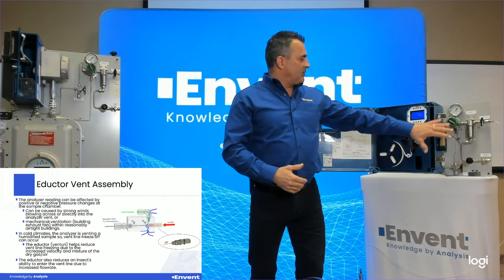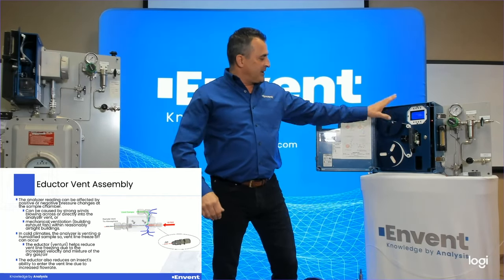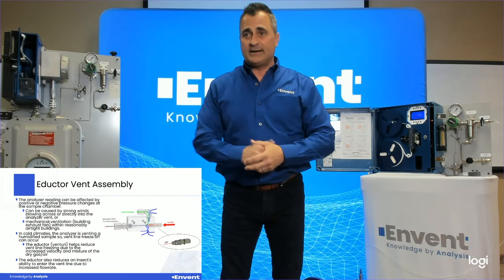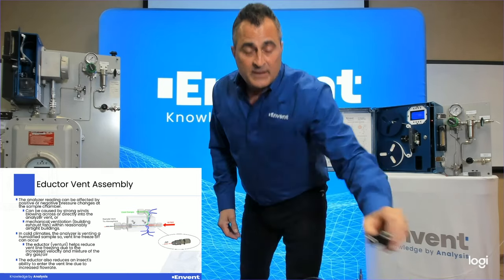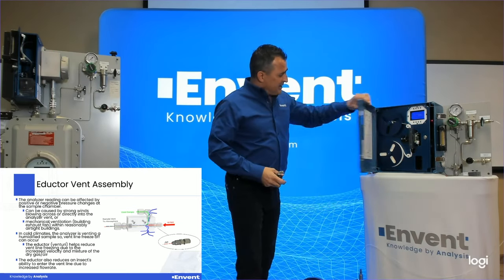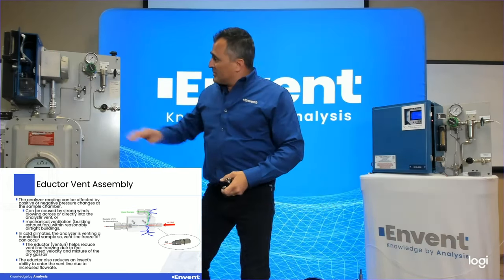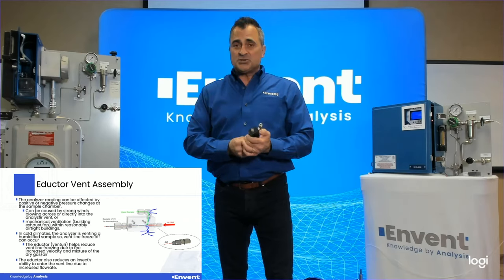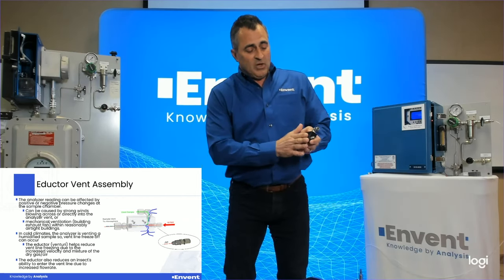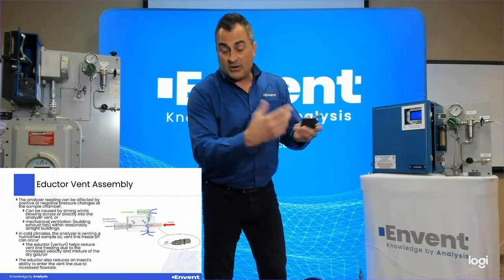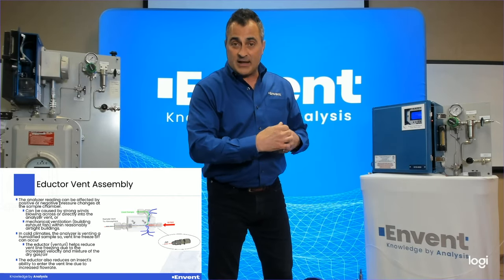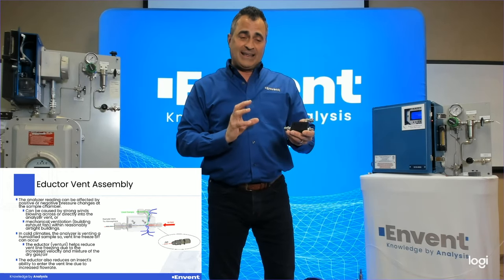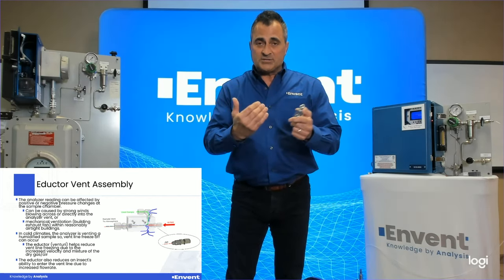Now we've talked about bringing the sample in, humidifying it, and running it through the sample chamber. Now we're talking about getting the sample out — out of the vent, out of the analyzer, and outside. What we have is an eductor. It's mounted on the analyzer — all our analyzers come with this eductor. Basically it's a venturi. We put this block at the end because our spent sample exiting the sample chamber is vented outside. We do not recommend putting any resistance on that vent, or you're going to affect the pressures at the sample chamber.